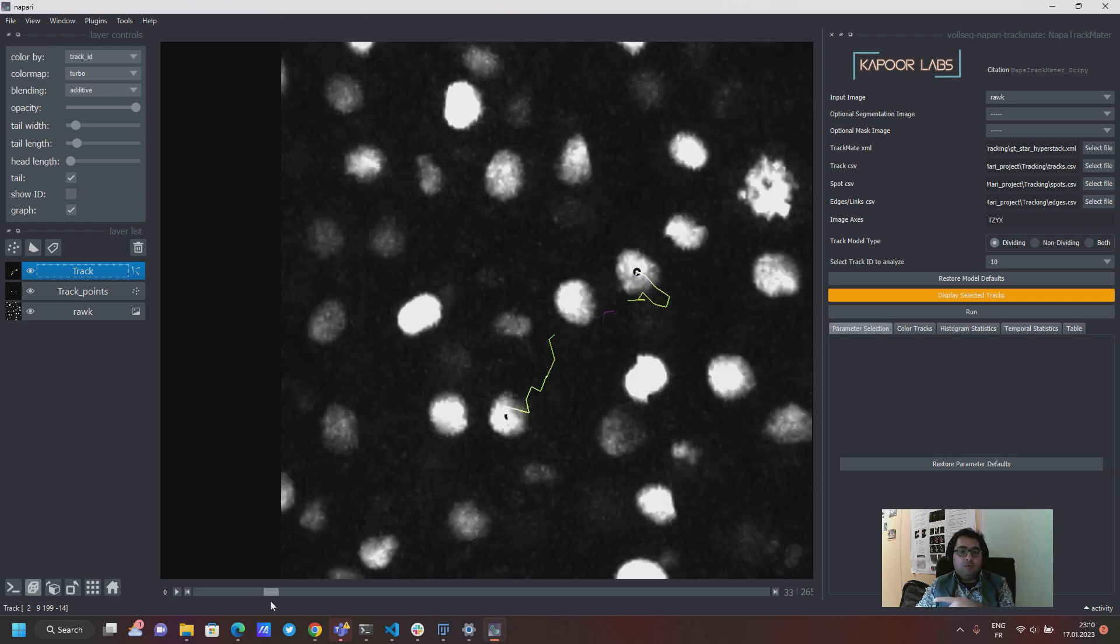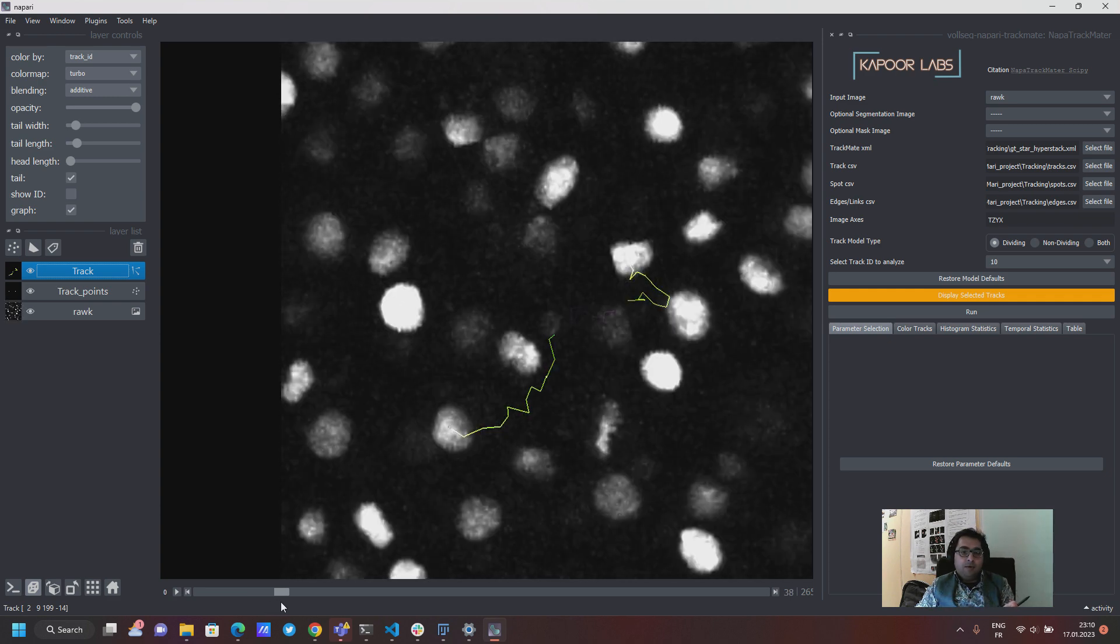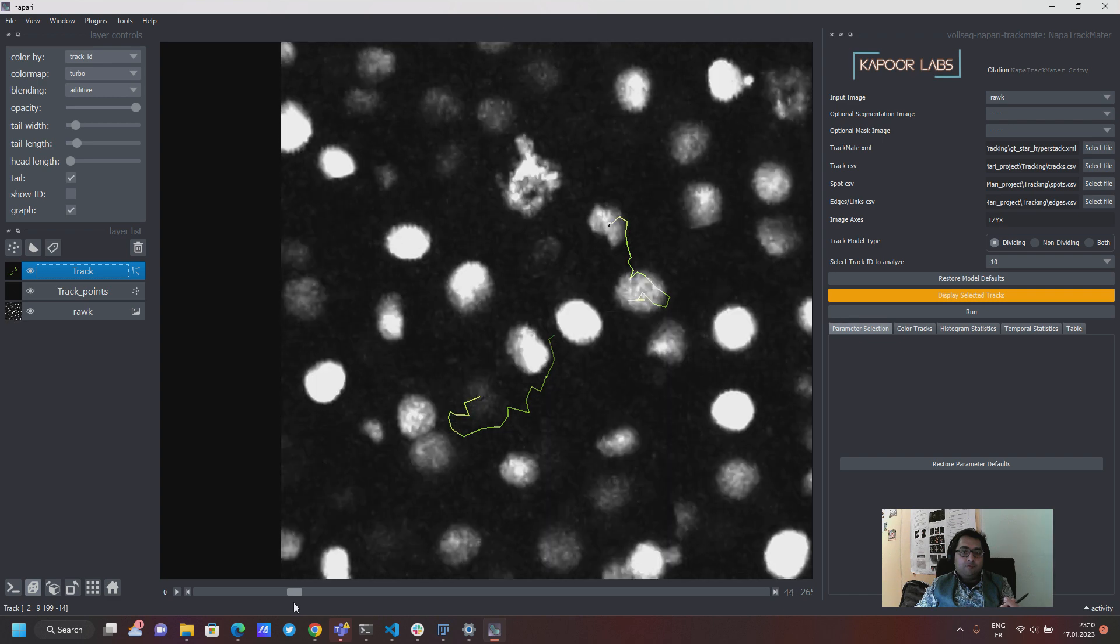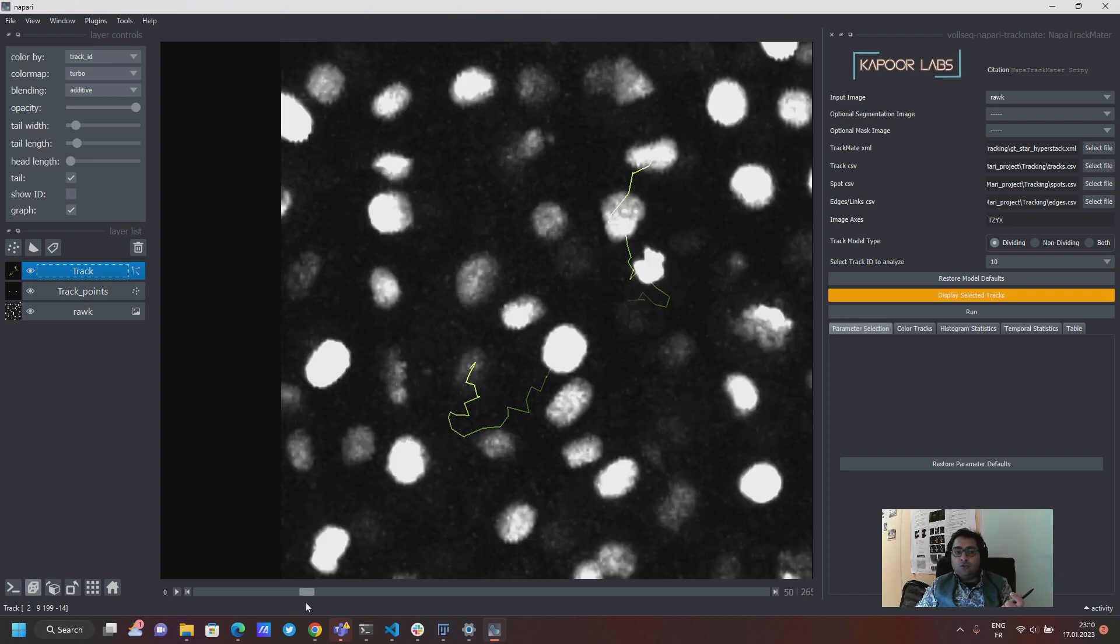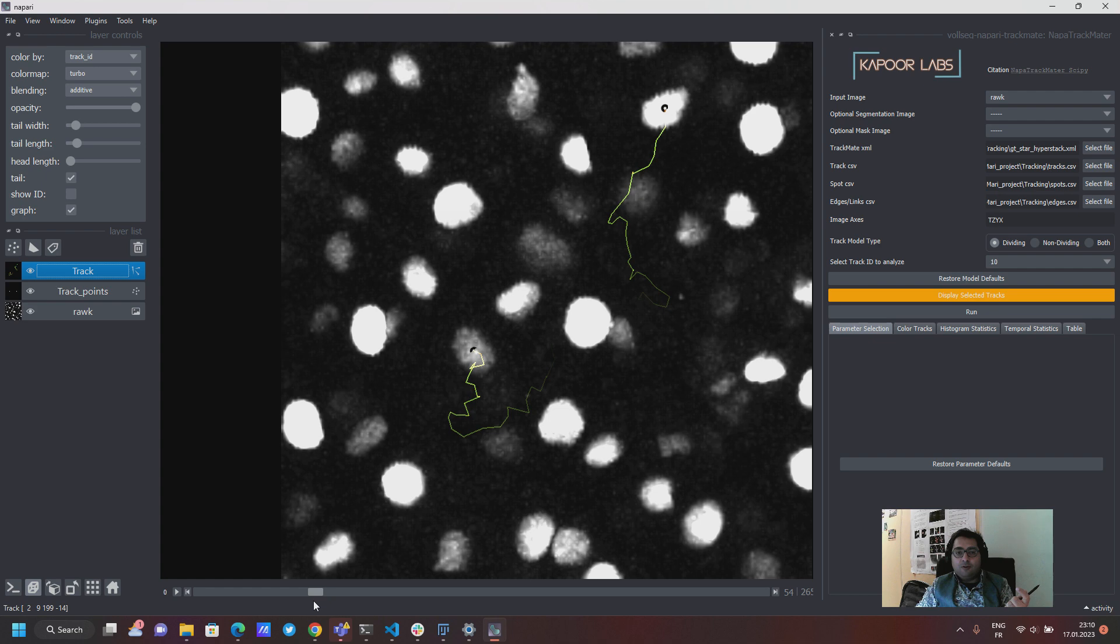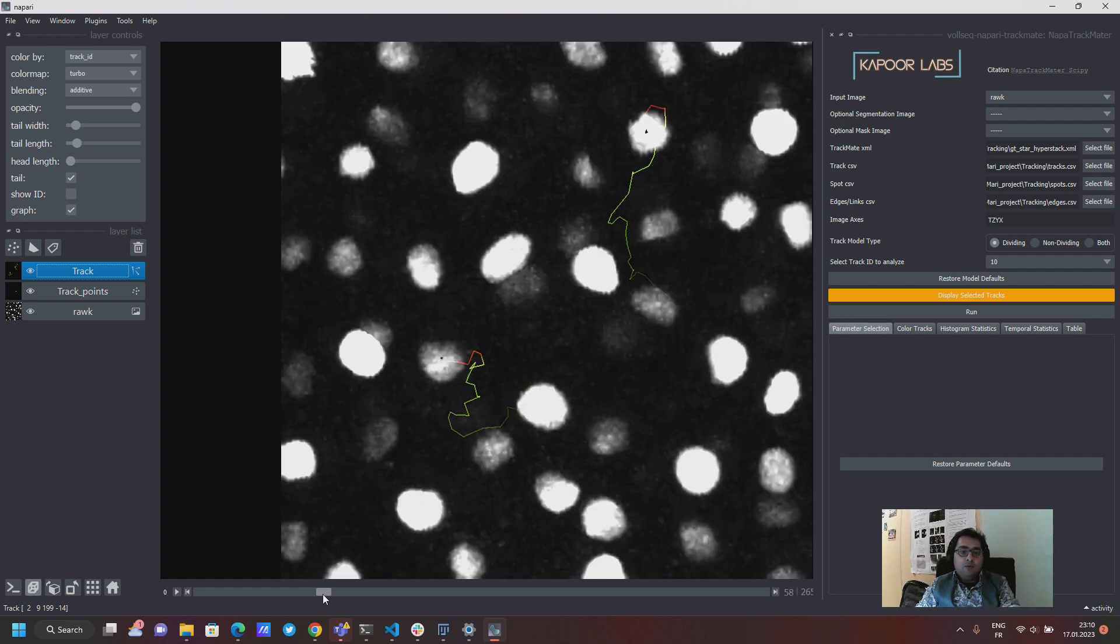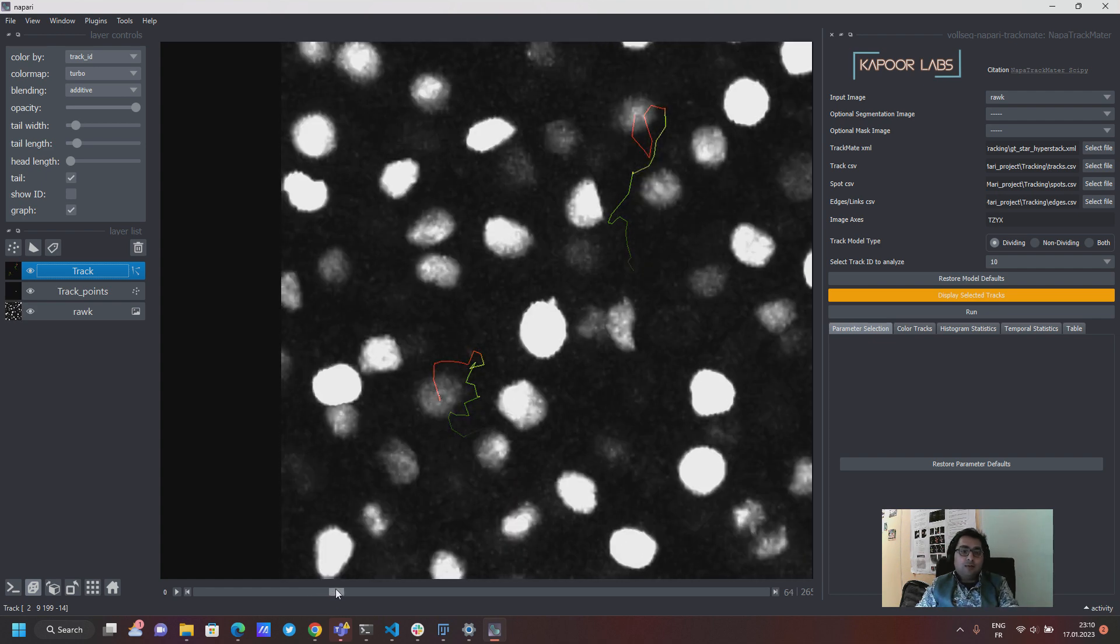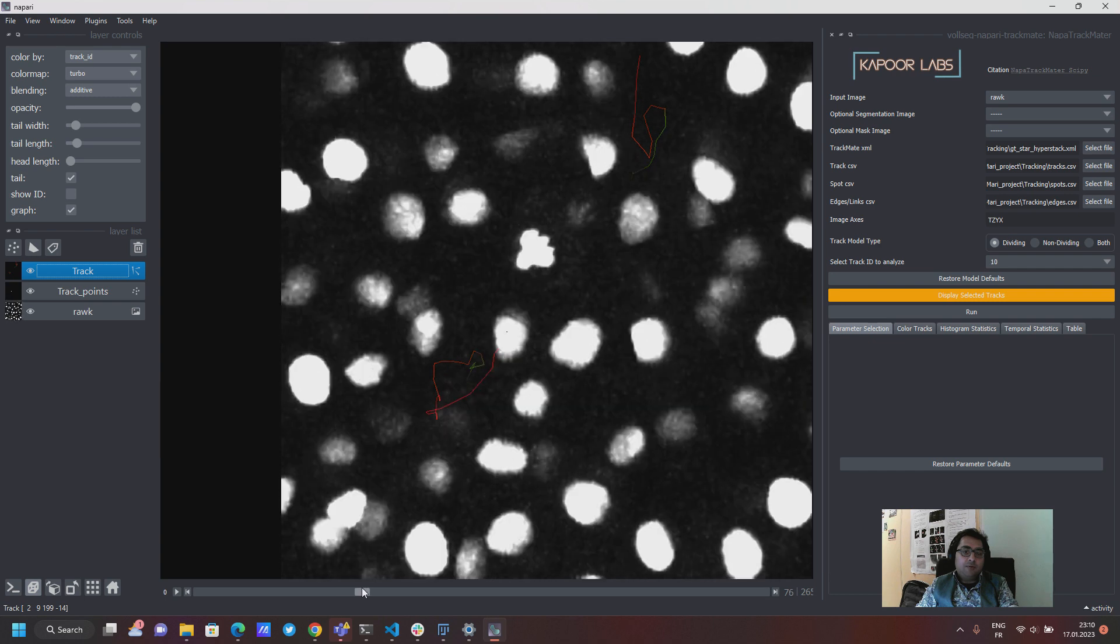And so here by default you get a track ID as a default color of the track but now you can also choose differently how to color these particular tracks.